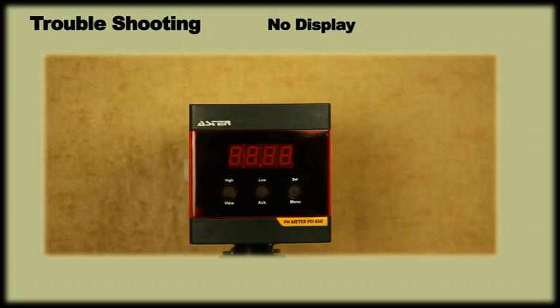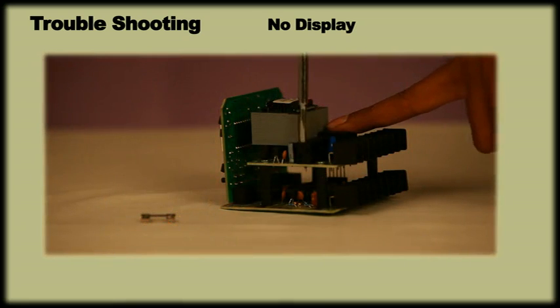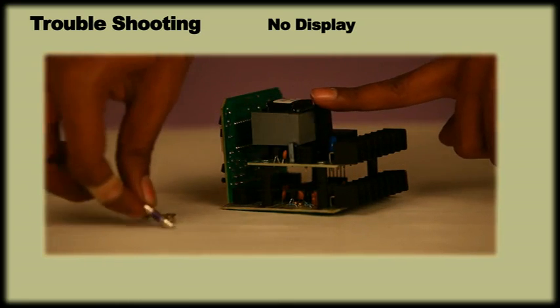Troubleshooting: If the meter shows no display, check the input supply with the help of multimeter and ensure it gets required supply. In case display remains off despite proper supply, open the instrument and change the fuse with the new 630 milliampere fuse.